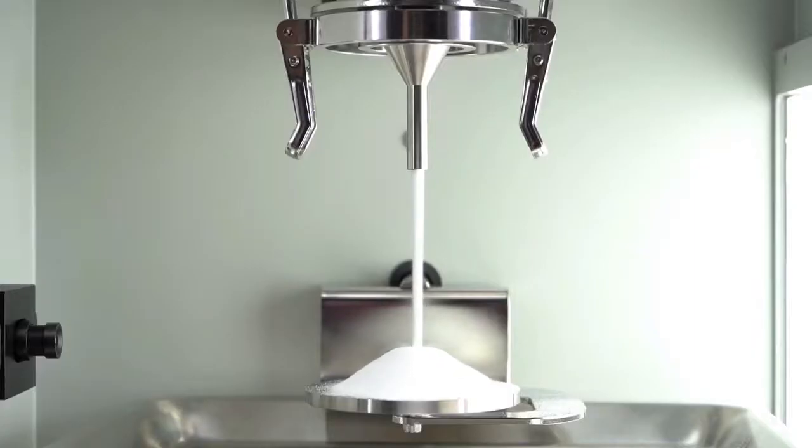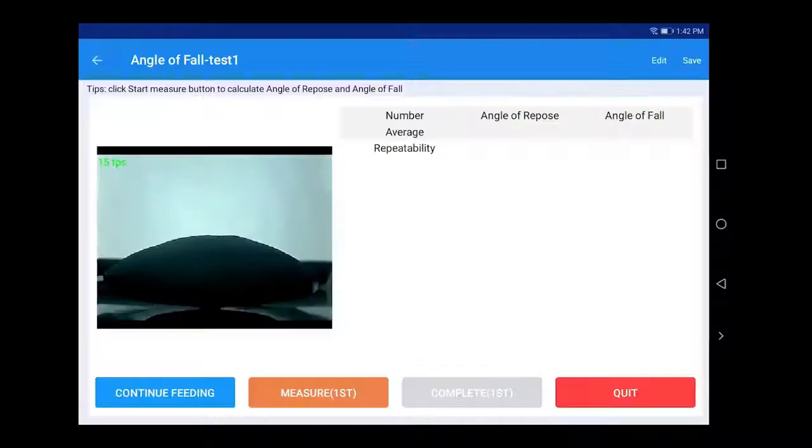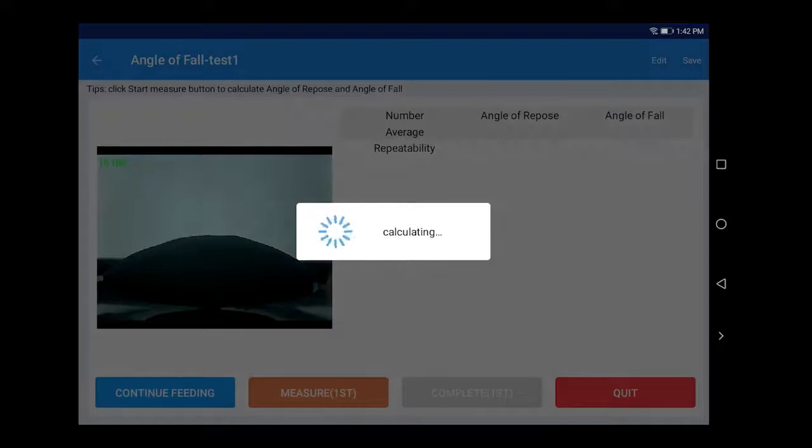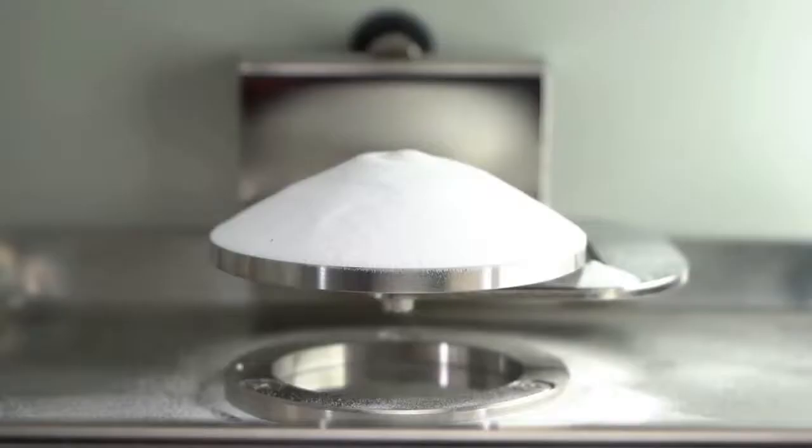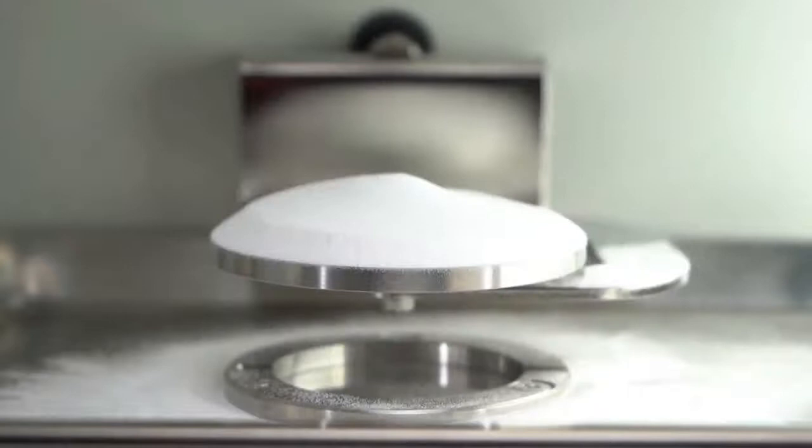Stop feeding when a symmetrical sample powder cone is formed on the angle of repose platform and there is powder falling around the platform. Click Measure first to end the electromagnetic vibration. The system will automatically shoot an image and calculate the angle of repose and the angle of fall.